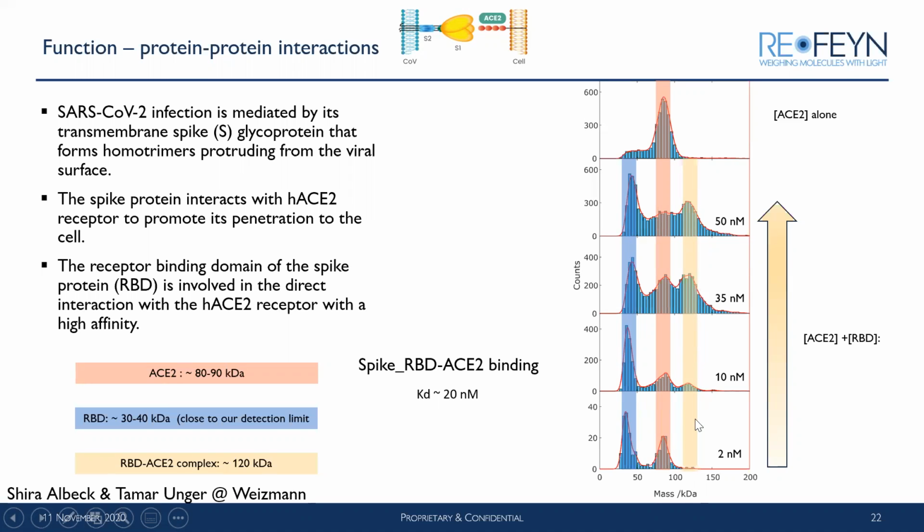You can quantify, based on those plots, where approximately the KD of the interaction lies, and it's approximately 20 nanomolar. So again, quantifying the affinity of the interaction.